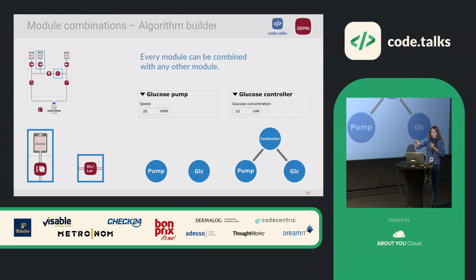With this, you can really control your glucose concentration. So in the UI, you can set, I actually want in the machine a concentration of 10 millimole of glucose, for example. And we also would like the user to decide which algorithm is run by this controller. If you know something about controller theories, you can use different controller types to control this. You can have a PID controller, a 2-points controller.